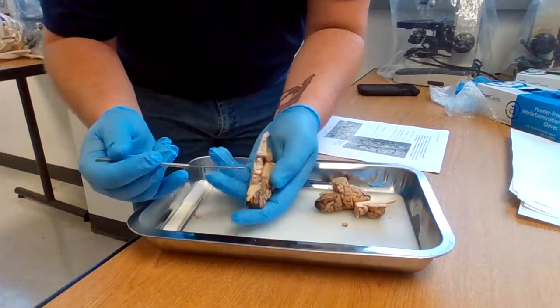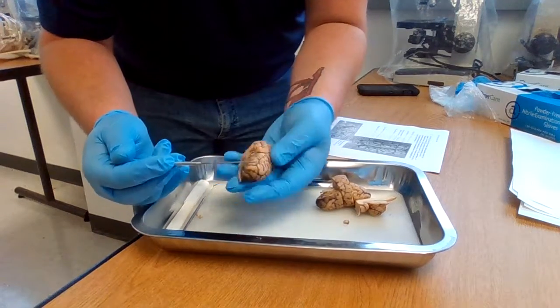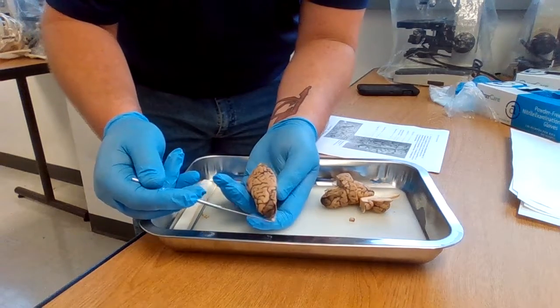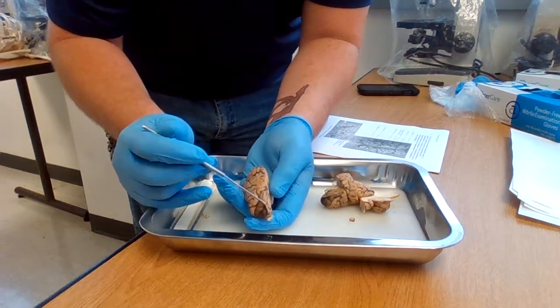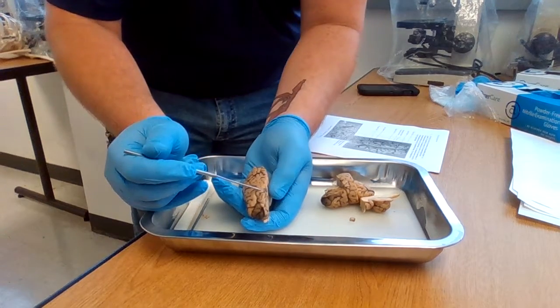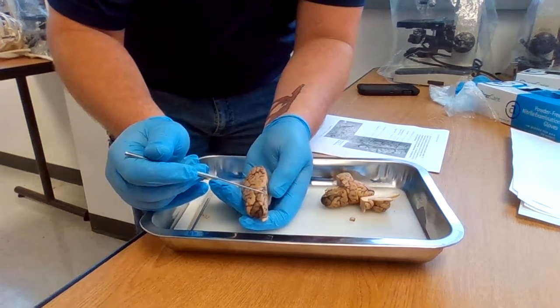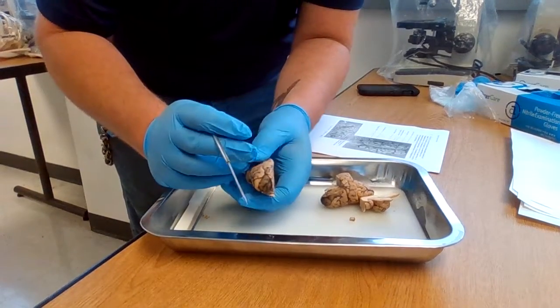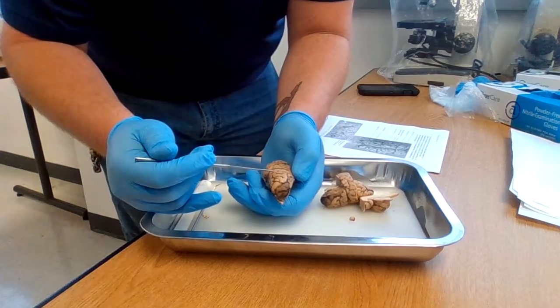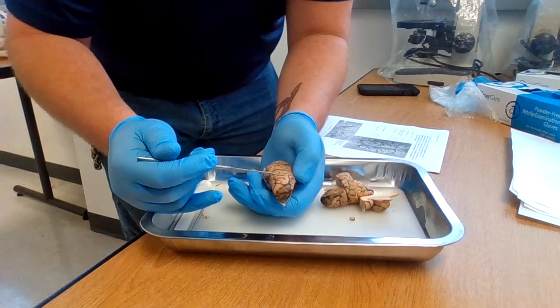We're going to be doing the lobes next. This is going to be the frontal lobe with the ansate sulcus. We did it on the wrong side. Should be right here.